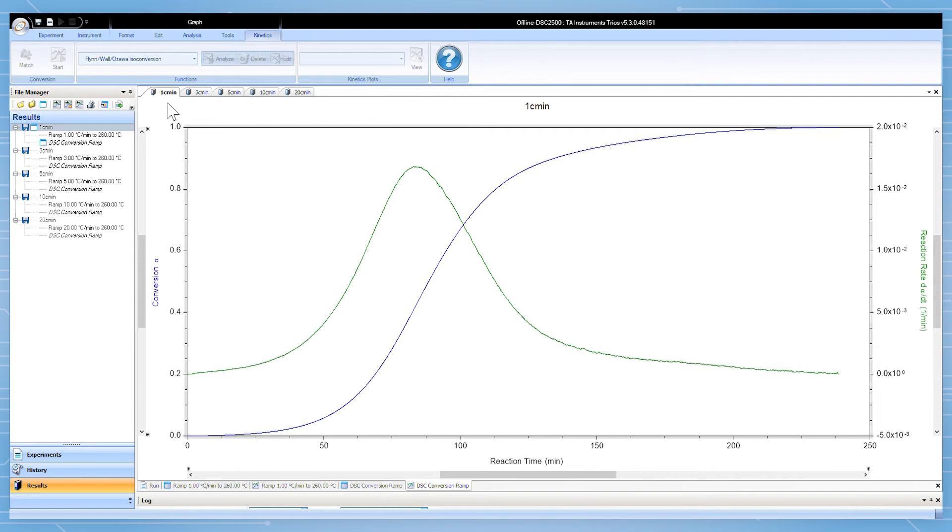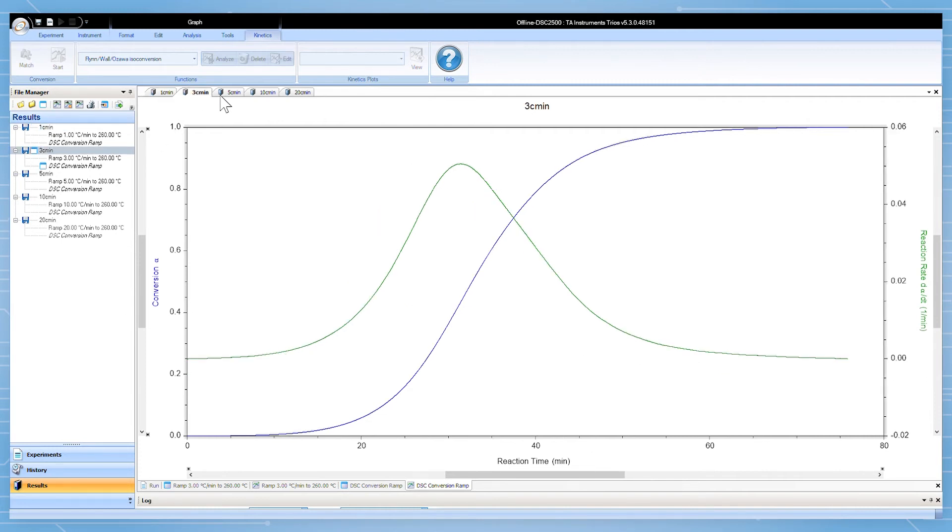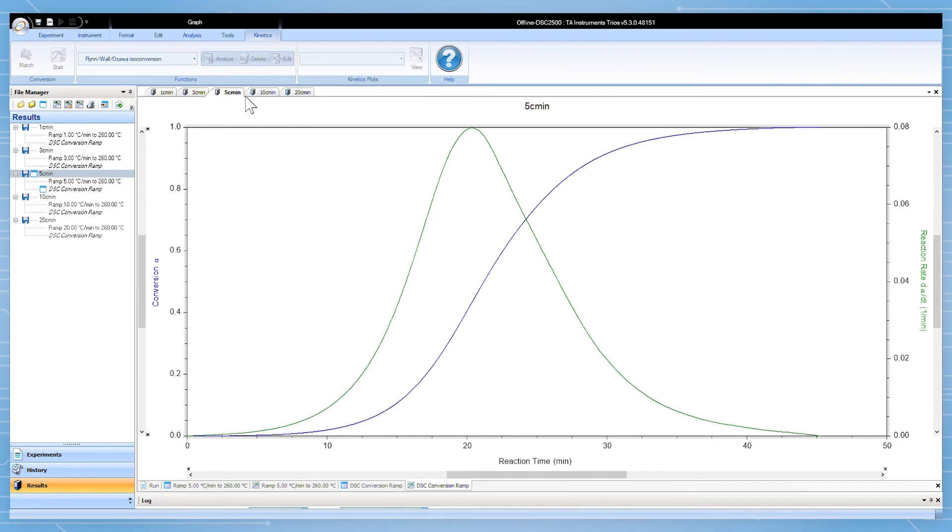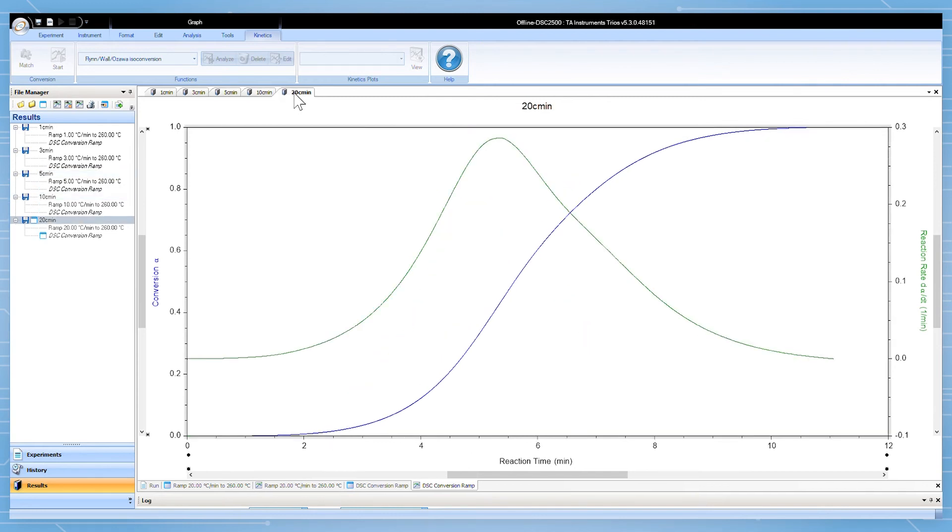A similar workflow is used to analyze multi-file DSC kinetics. First convert each file individually in the region of interest. I've already done that for these five files. Highlight all the converted files by holding the shift key.